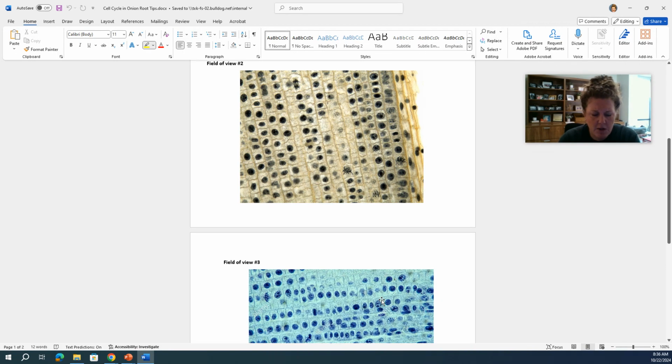And so essentially what you need to do is just know, what am I looking for? So for interphase, you're looking for a complete nucleus with nucleoli in it, the chocolate chip cookie. With prophase, you're looking for the broken nucleus. It's got the chunky chromosomes. Metaphase is the middle, and anaphase are going to be the claws because they're being pulled apart. And then in telophase, you should see two new nuclei, and you will most likely also see that cell plate, which is occurring during cytokinesis.